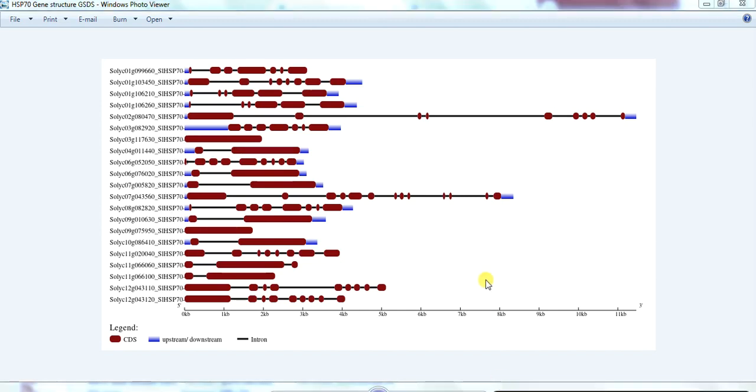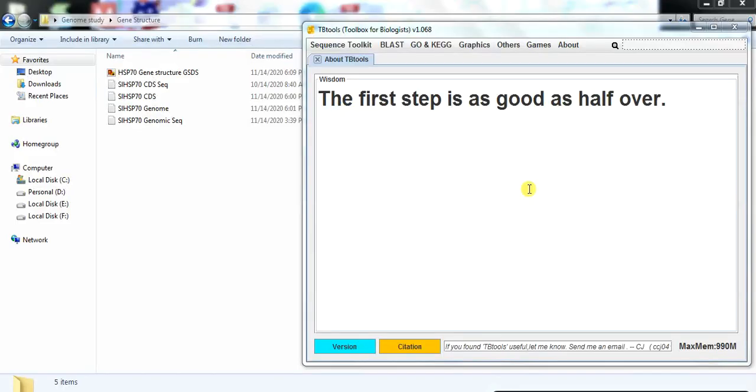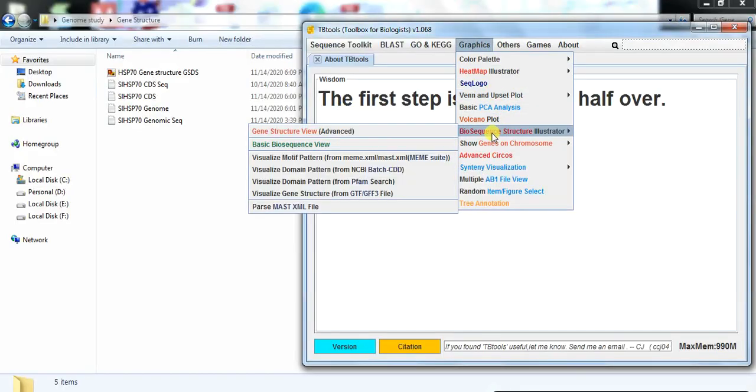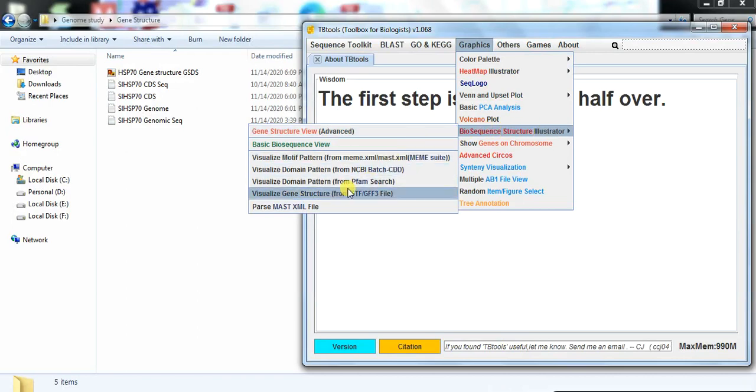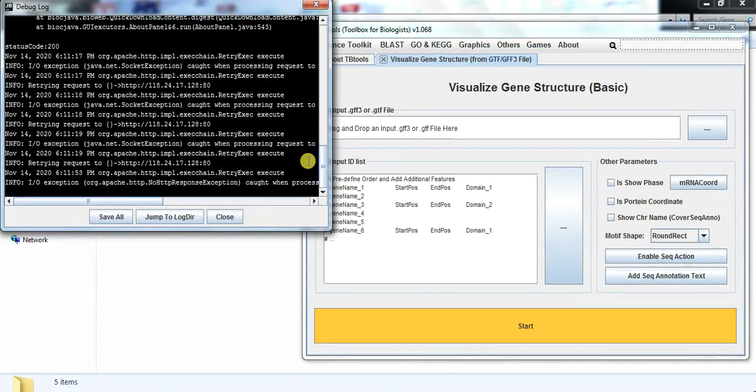Now we will try to make the gene structure figure in TB Tool. So first open the TB Tool, open the TB Tool, drop down Biosequence Structure Illustrator, and visualize gene structure.